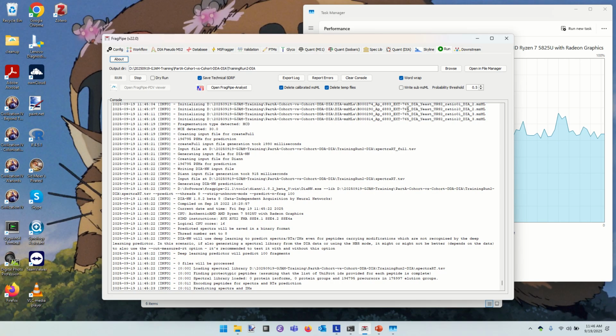I don't actually know how trustworthy the rule that a peptide shows up for 30 seconds is, because you frequently see very different measurements estimated by the median value, let's say. Some will be with very few, some will be with more, I guess. Yeah, okay. So that was our rationale with the Explorus.